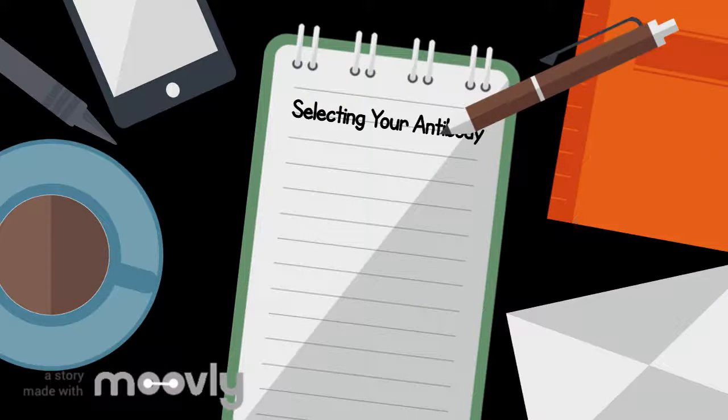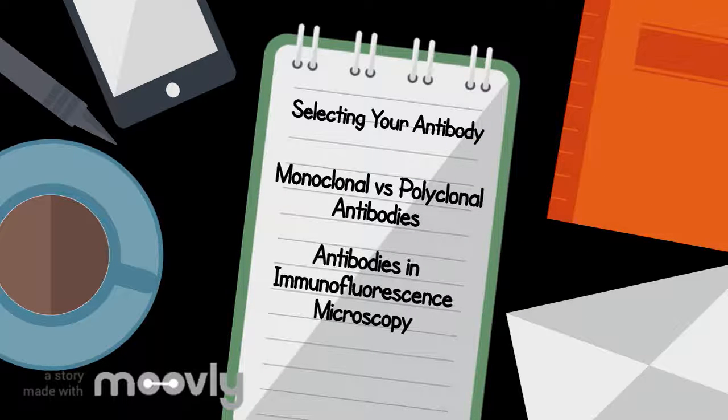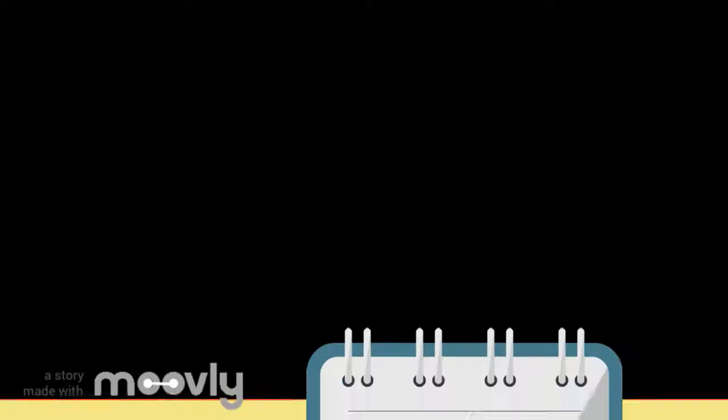We will be talking about antibody selection, monoclonal versus polyclonal antibodies, and antibodies in immunofluorescence microscopy.